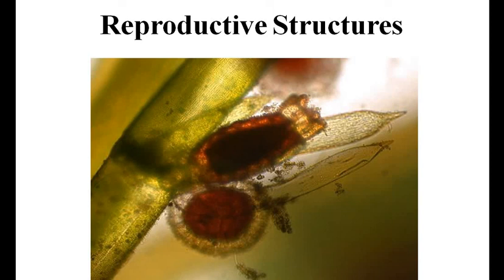The nucule is oval in shape and it is the female sex organ, situated above the globule at the node. It is enveloped by spirally coiled cells, the tube cells. At the apex of the nucule is a corona of 5 small cells arranged in one tier and attached at the point.